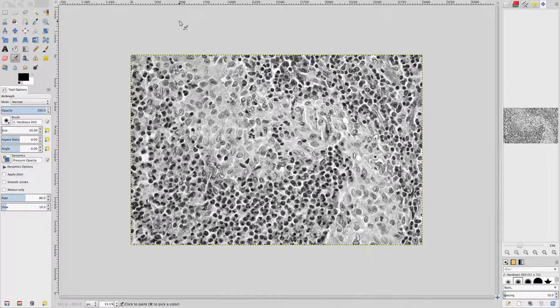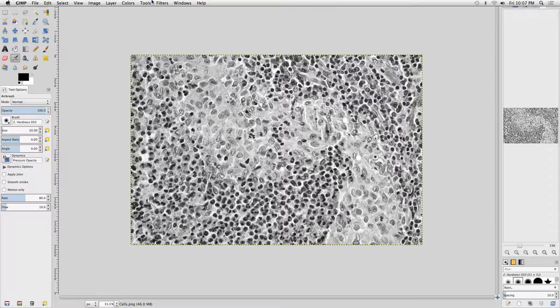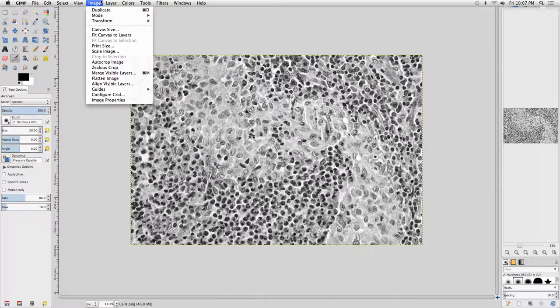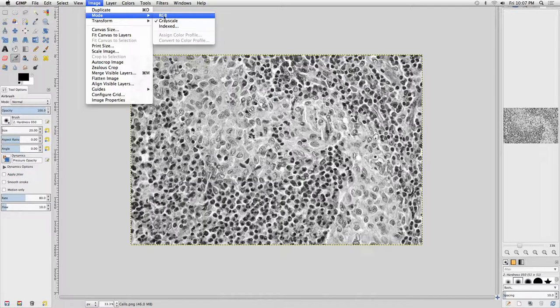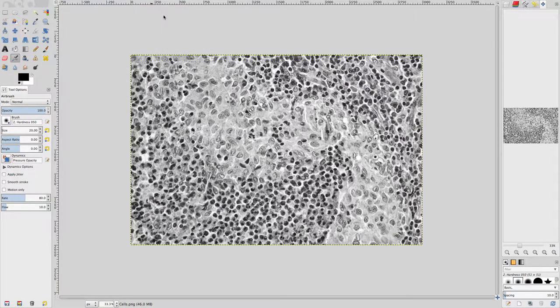In grayscale, there is only a single channel. The minimum intensity value in this channel is black, and the maximum intensity value is white. All intermediate intensity values represent gray values. Go back to the Image menu, select Mode, and click RGB to convert back to RGB color space.